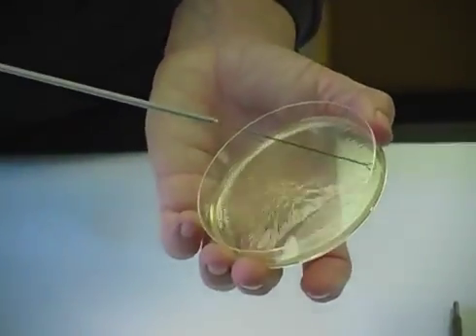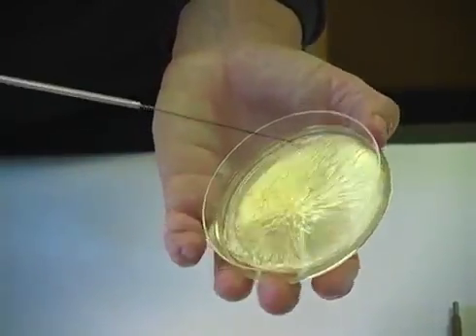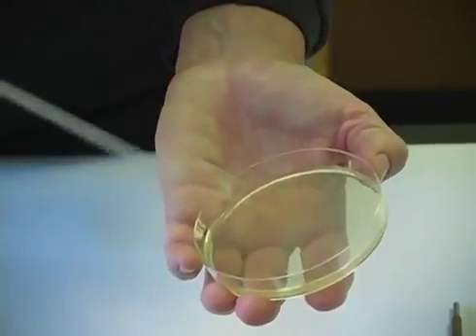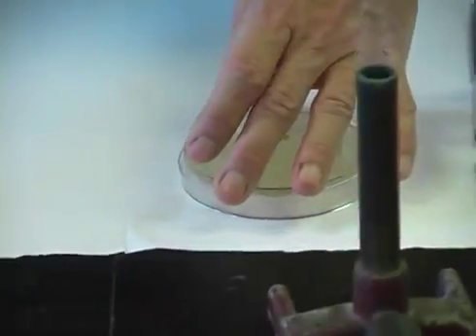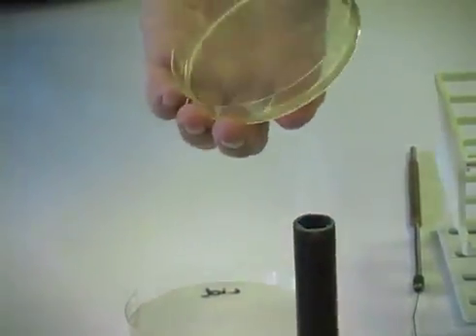I will transfer a few of my microbes from the first quadrant to the second quadrant, and now with my loop, spread them out over the second quadrant, close my plate, flame my loop to kill any remaining microbes, and repeat the procedure 2 more times.